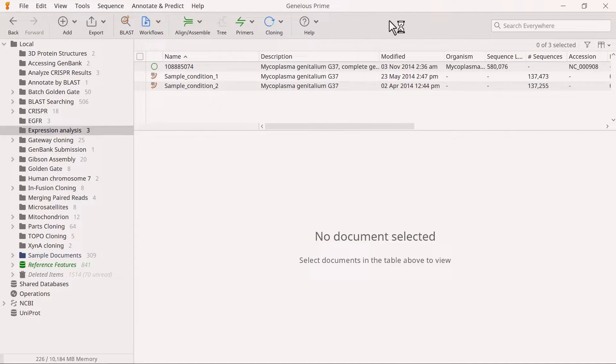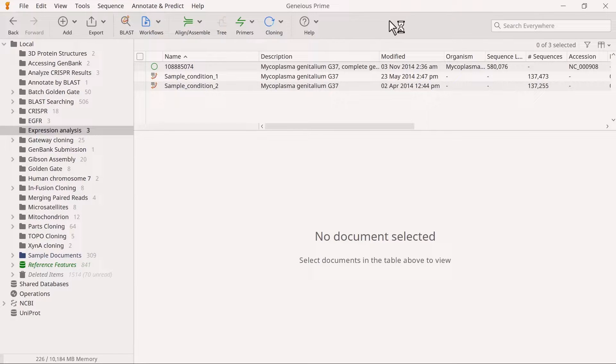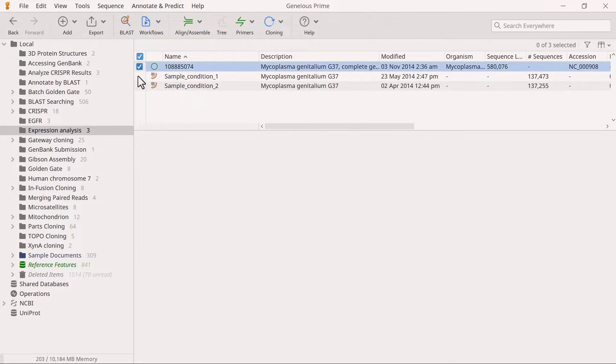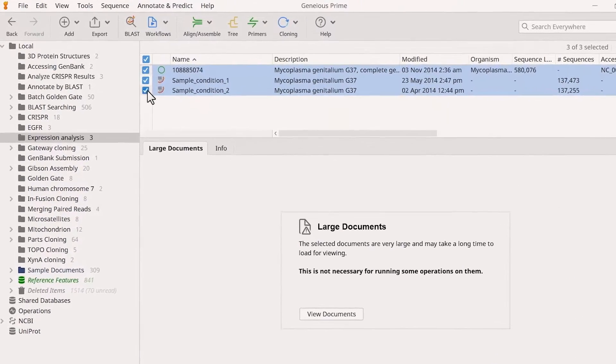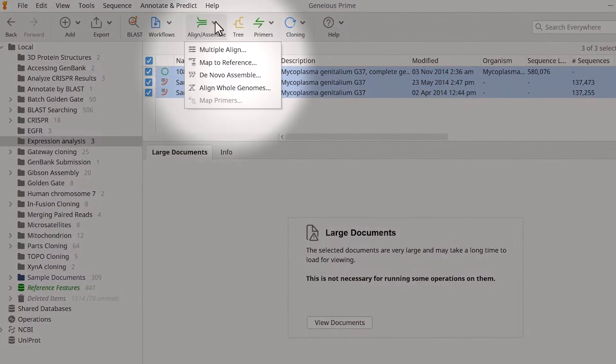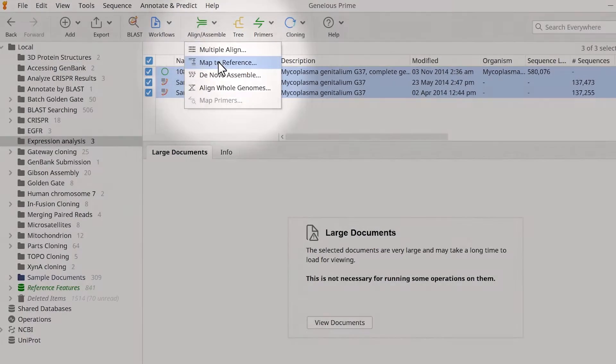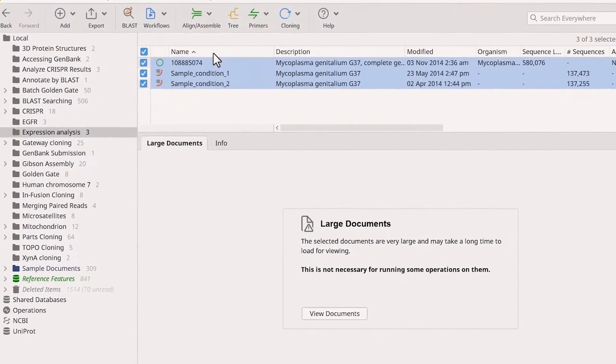I have two sets of RNA-seq reads in this example, each from a different experimental condition. I also have a reference sequence. Select the reads and the reference files, then go to Align Assemble and Map to Reference.